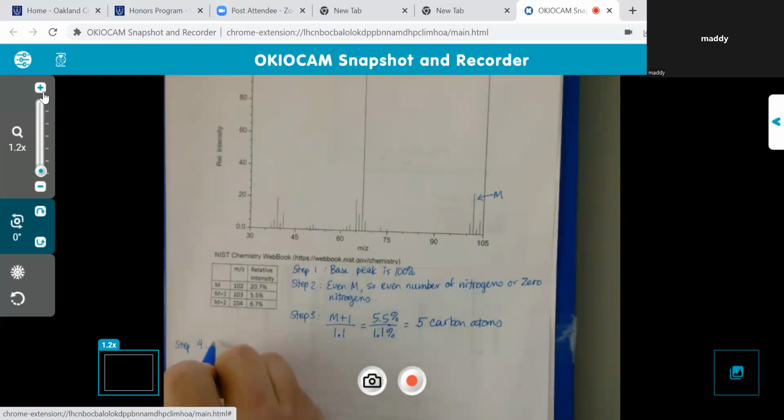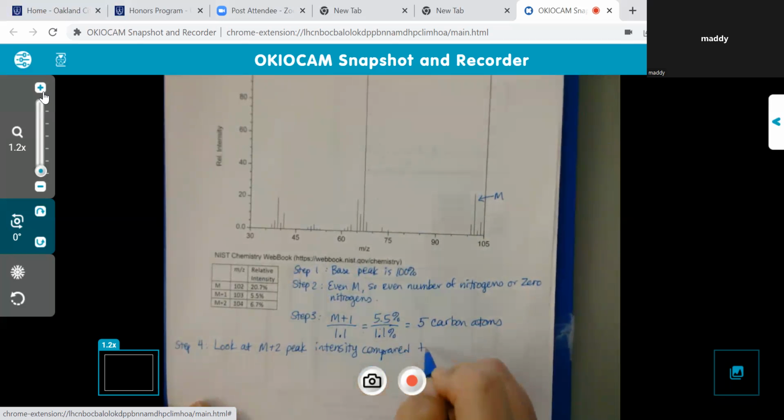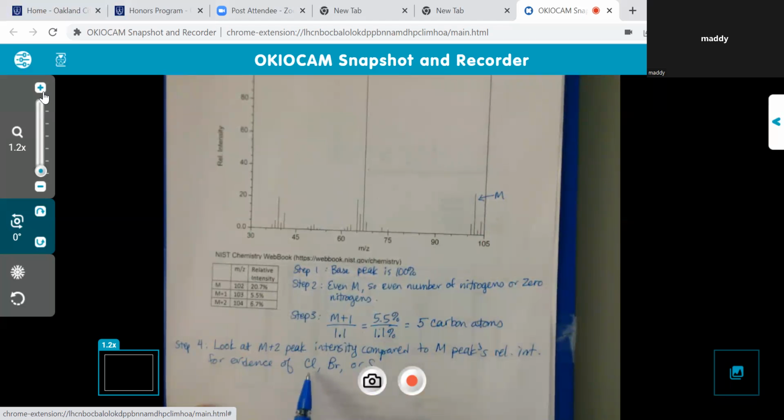Okay, so if you have chlorine, you would have a 3-to-1 ratio of the M to the M+2.